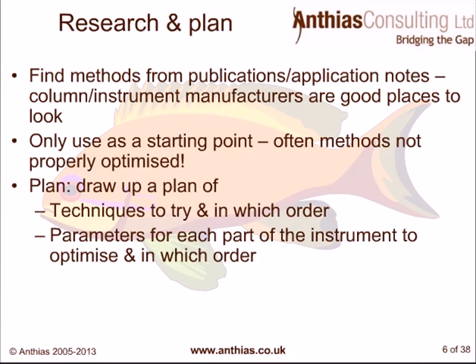So draw up a plan. I just tend to take an A4 or maybe even A3 piece of paper, draw it all up on there, and then that can really aid you with your development, particularly over time. Also, when you get your method almost finished and you suddenly encounter problems maybe with a particular matrix that you haven't actually tried before, then again you can go back and review your plan and see if there's anywhere that you can possibly tweak or improve on if you don't quite get the robustness that you needed for your particular method.